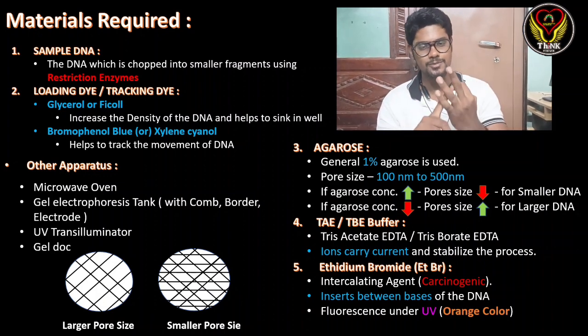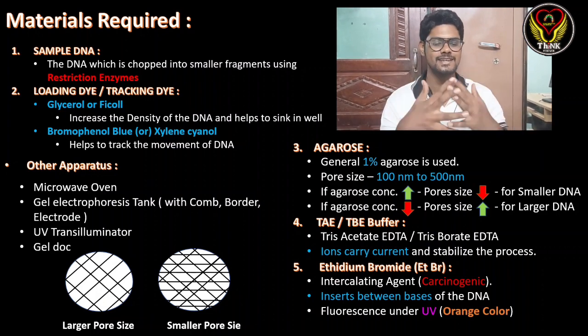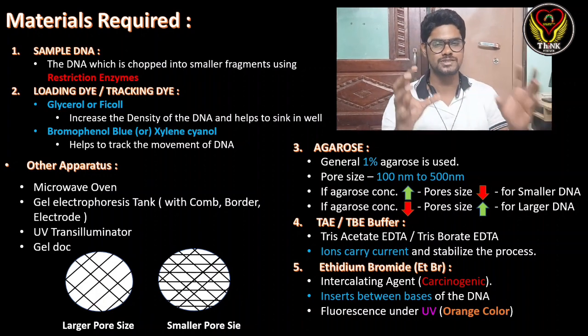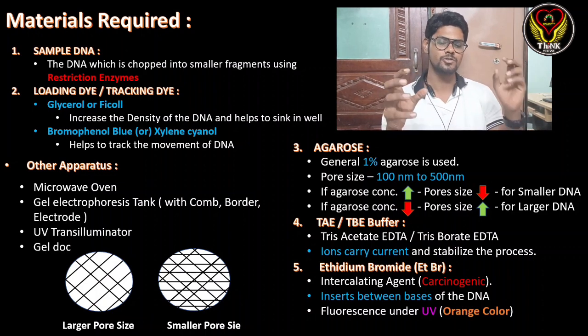The third and most important thing is agarose. This is the one which will make the gel. Generally we make 1% to 2%, mostly 1% to 1.5% or 2% of agarose. The pore size will be 100 nanometers to 500 nanometers.